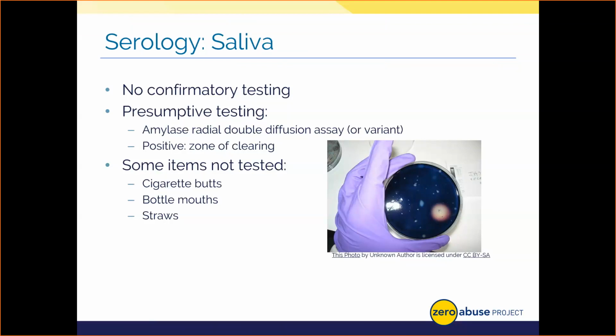Now, what'll happen during that time is the sample diffuses and spreads into that jelly, that agar, from its well. And if amylase is present, it'll react with the starch. See, if amylase is actually in your sample, it'll diffuse into that starch agar matrix, and it hydrolyzes or breaks down starch into a simple sugar. Now, I always tell folks as an analogy that amylase is why M&Ms melt in your mouth and not in your hand. After 24 hours, we end up flooding that plate, after the samples had time to permeate into that agar, with iodine. If amylase isn't present, that means the starch in the agar was not broken down.